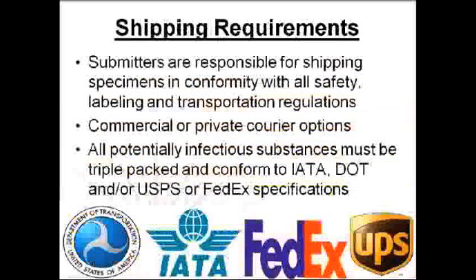Okay, for shipping samples to us, it's always the shipper's responsibility to ensure that all the regulations were conformed to, not the recipient. So there are commercial and private couriers that are available to you, and also keep in mind that anything that is potentially infectious and being shipped needs to be triple packed and conform to IATA, DOT, and/or Post Office and FedEx specifications.